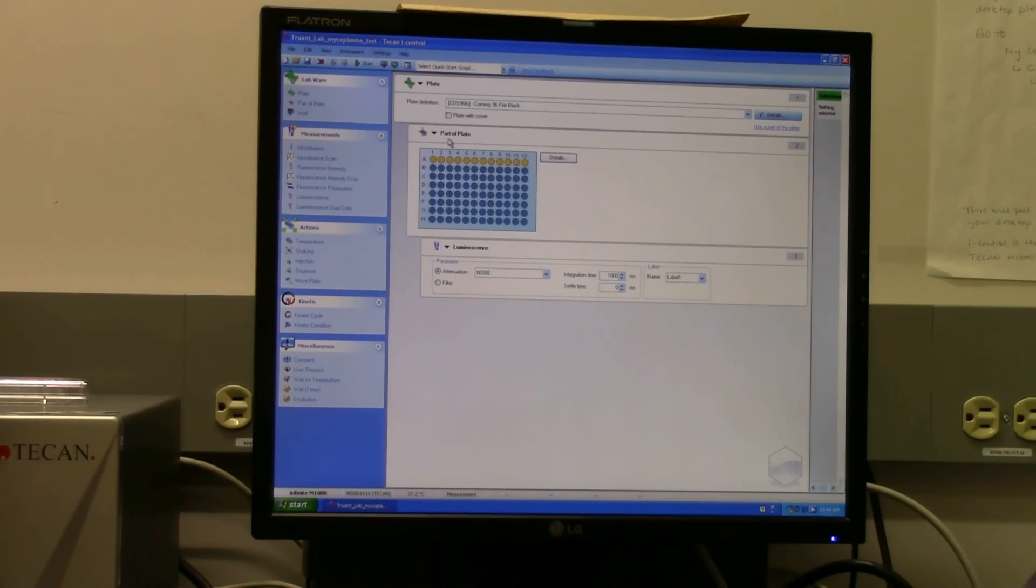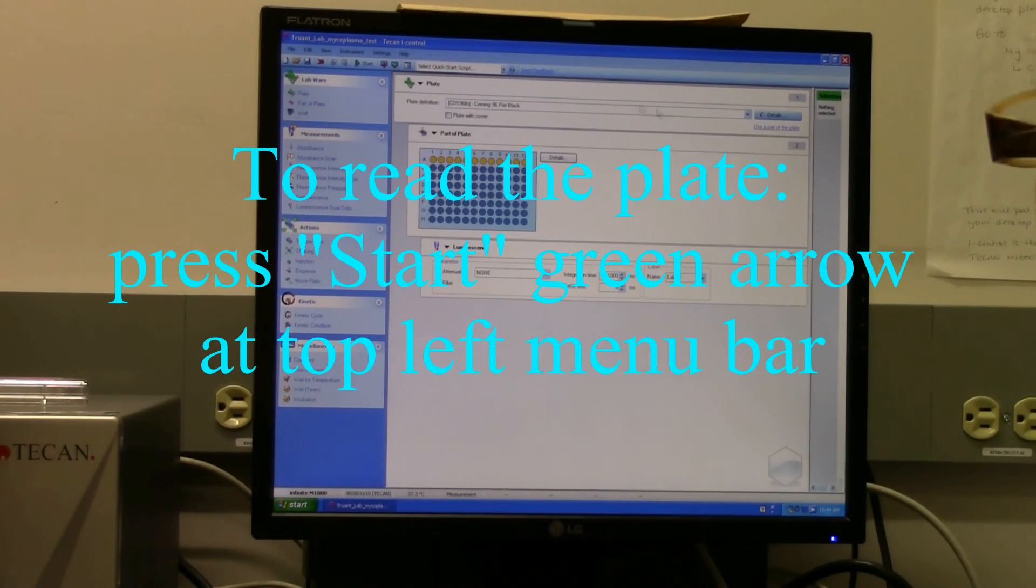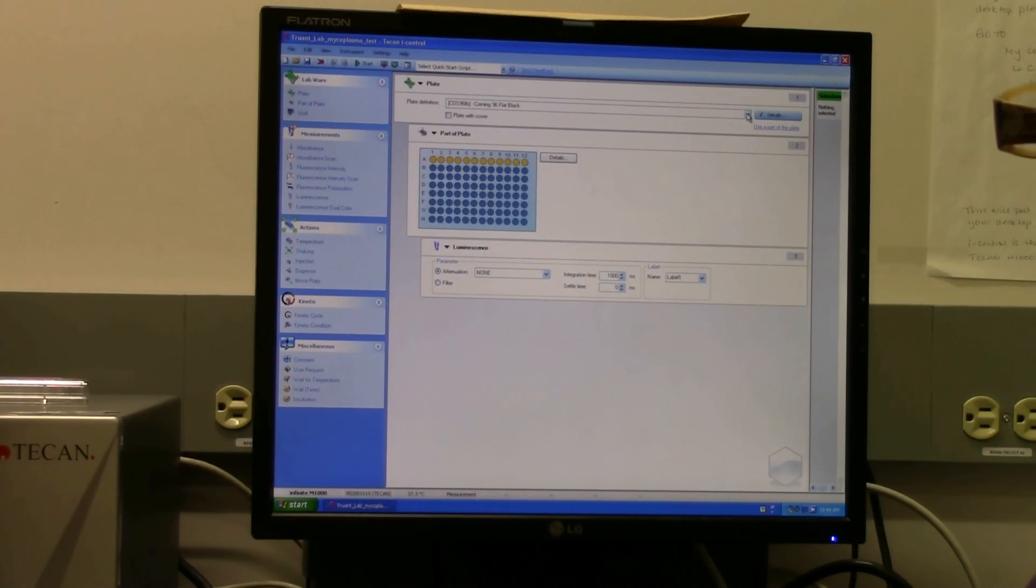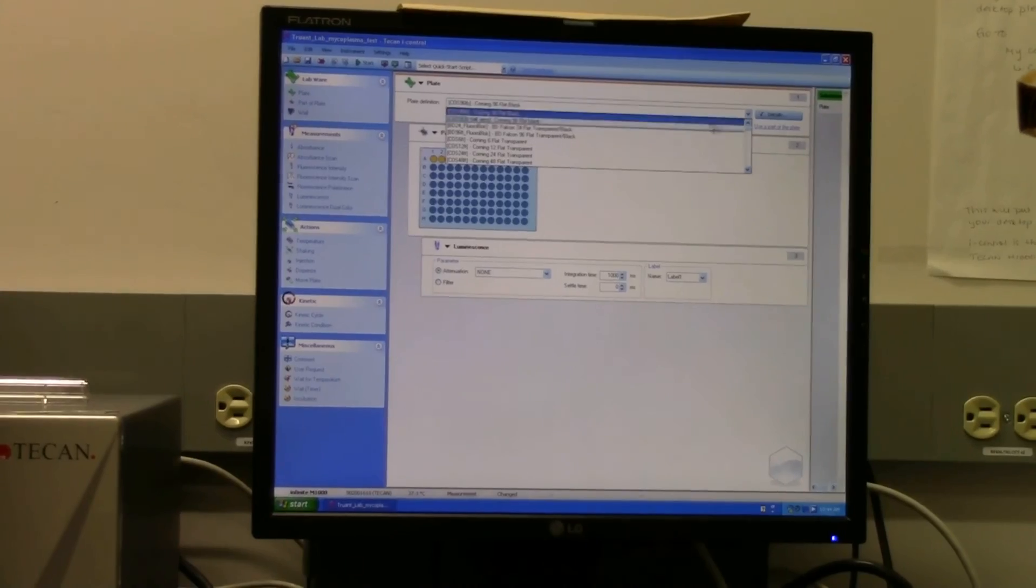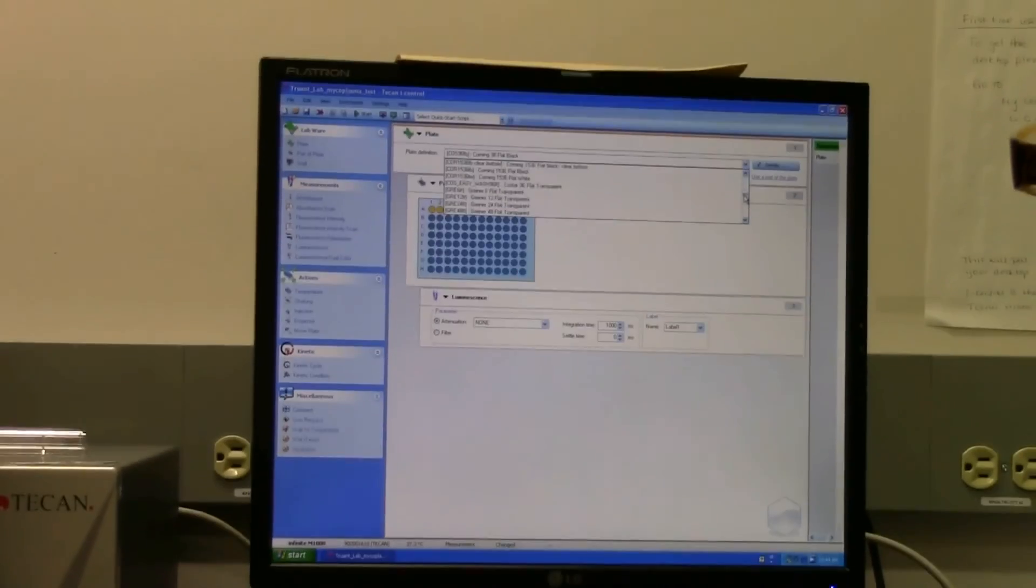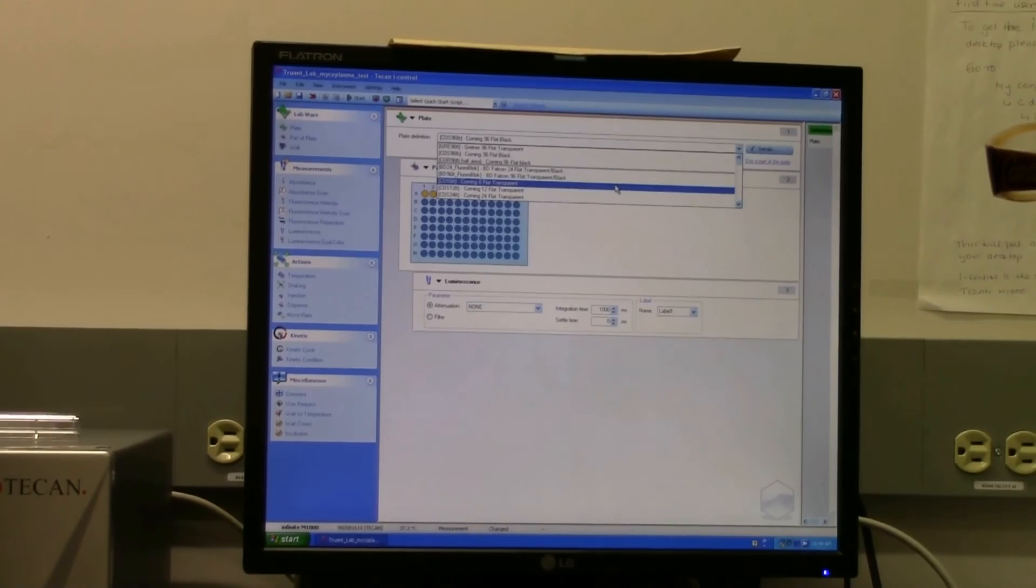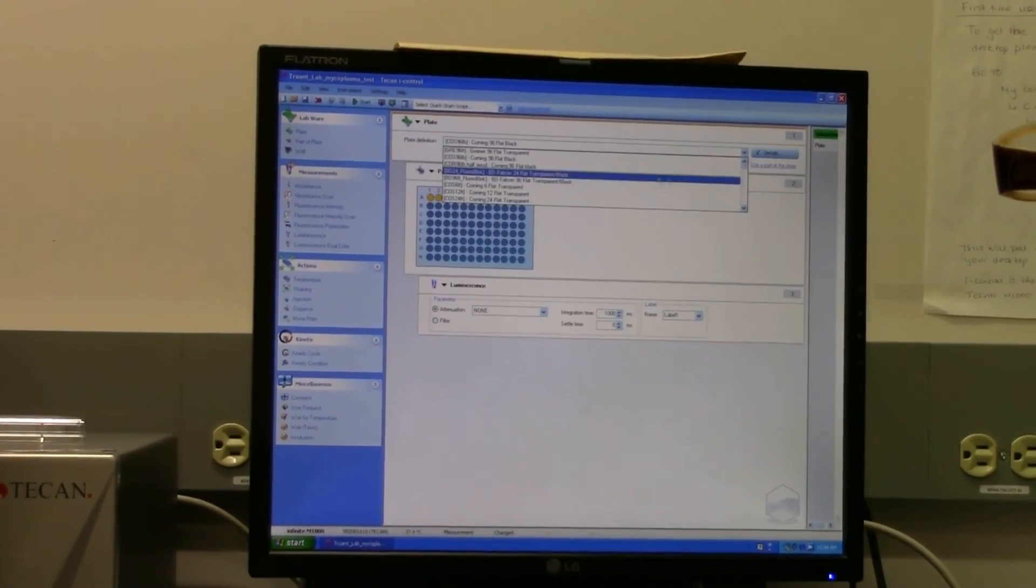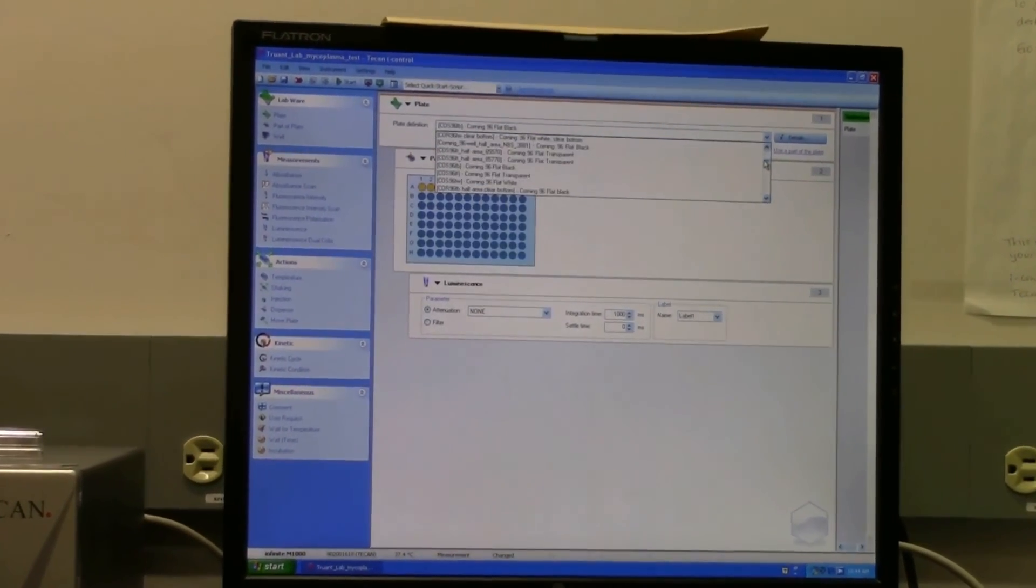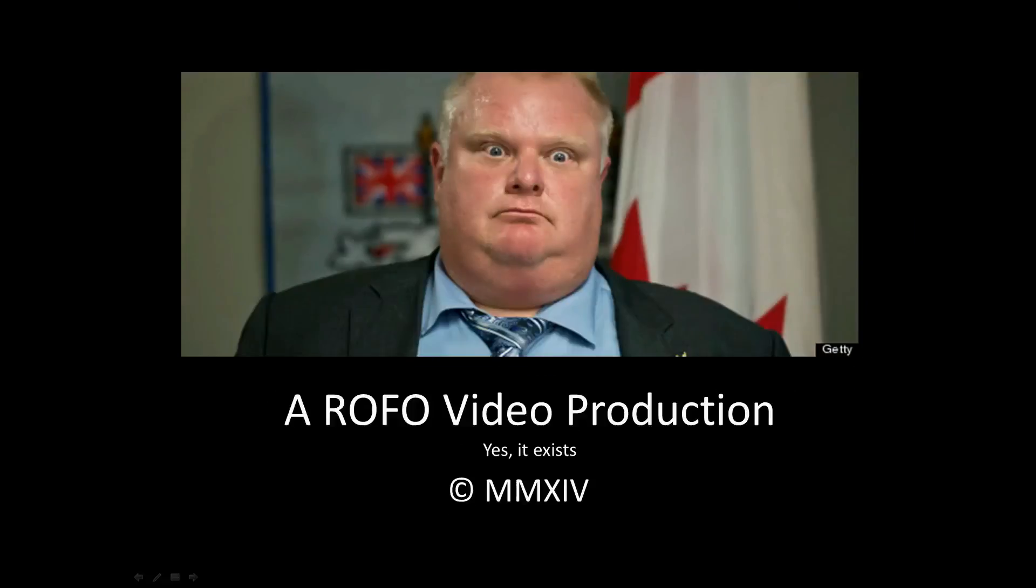The other thing that I neglected to talk about was the actual plate definition files, which are up at the very top here. So there's a drop-down menu here to select the type of plate that you would be using. There are a lot of different plates, and it is important to have the right plate definition file so that the instrument can do the right read. So just make sure you know what type of plate you're using and then just select it from in here. And that's pretty much it.